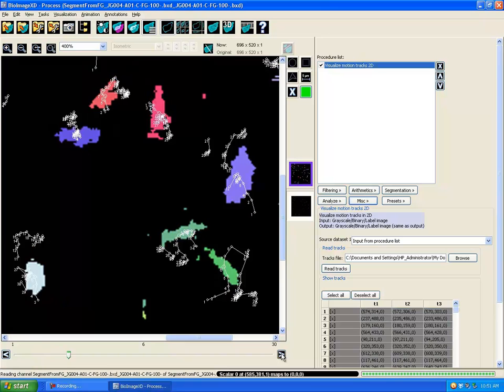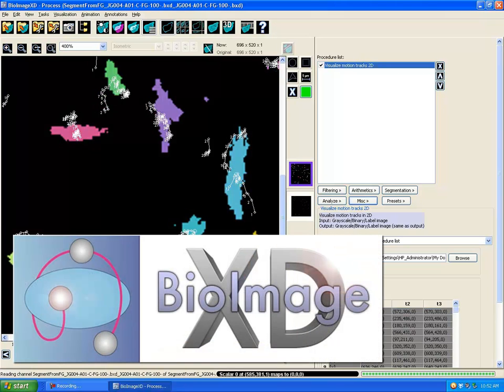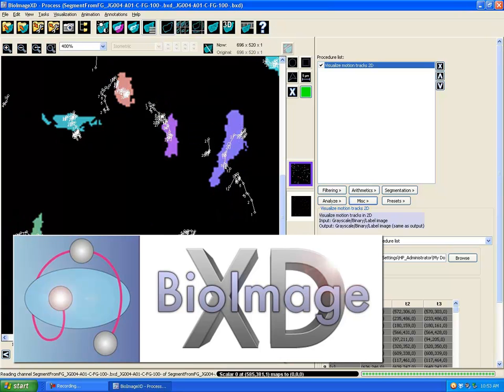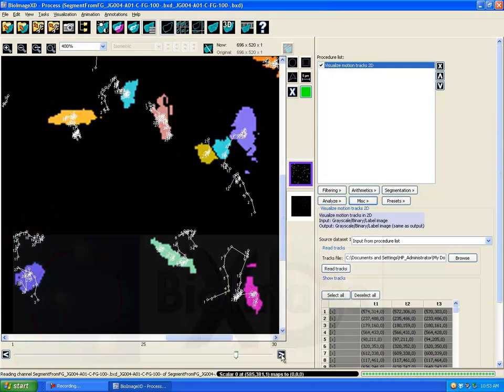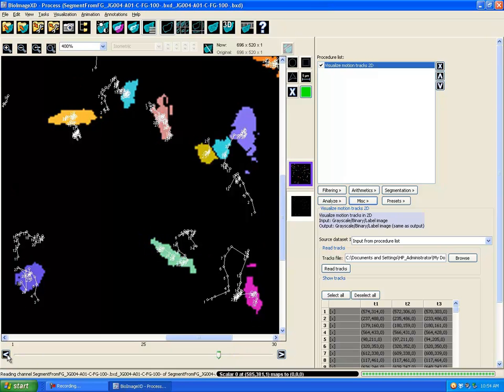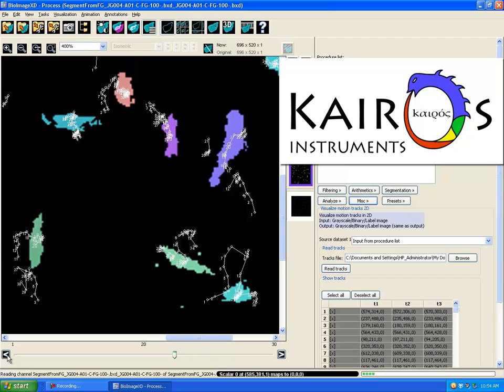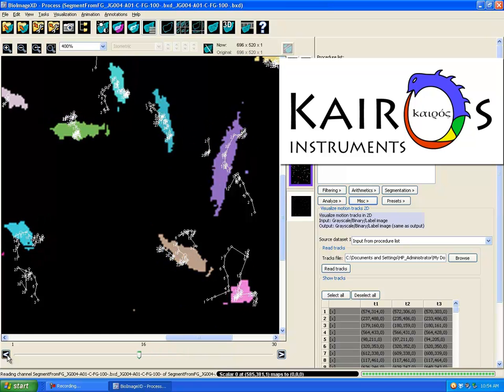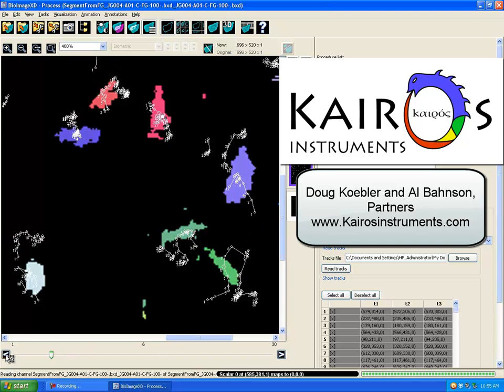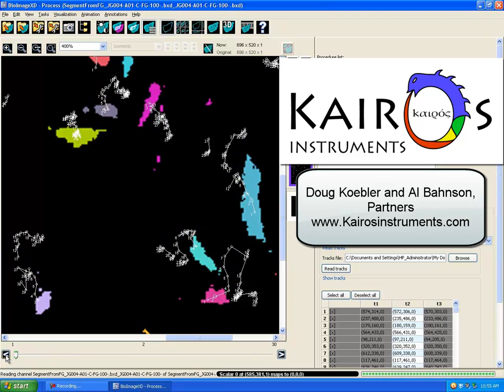So we found BioImageXD to be an incredible program for tracking. It handles everything from start to finish, and this is just one of many strengths that we would like to look into further. So if you are interested in this and would like step-by-step instructions or training, we would be happy to try to help you.